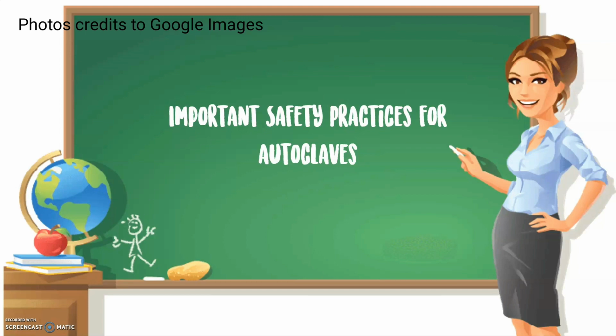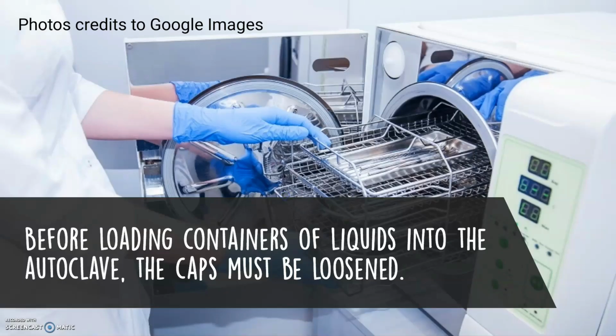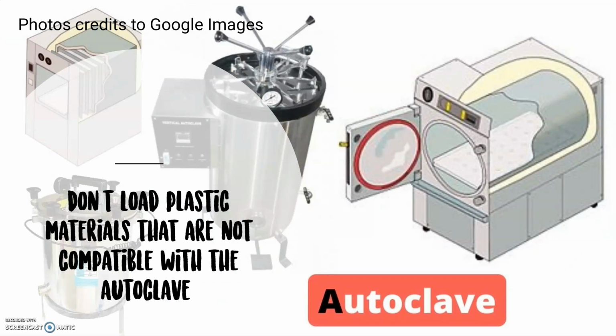Now, let's move on to important safety practices for autoclaves. Load the autoclave properly per the manufacturer recommendations. Before loading containers of liquids into the autoclave, the caps must be loosened. Use an autoclave safe tray with a solid bottom and walls to contain the bottles and catch spills. Don't load plastic materials that are not compatible with the autoclave.